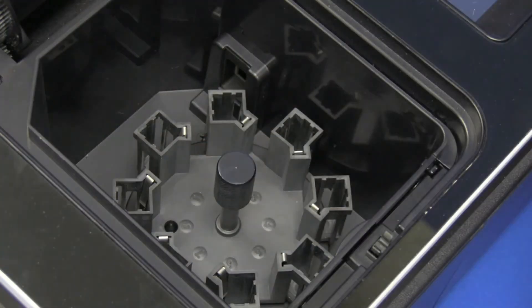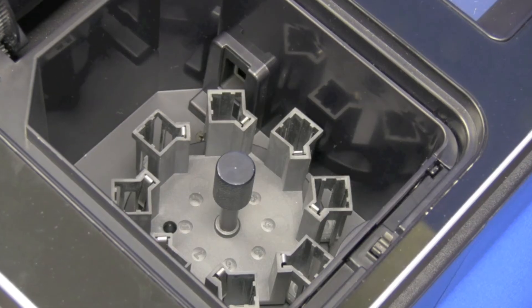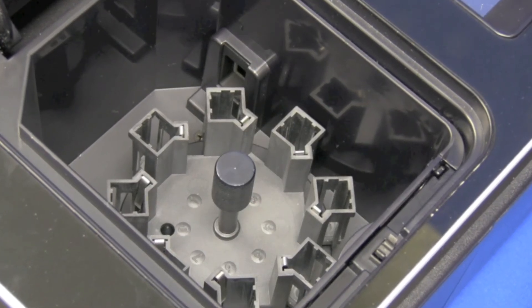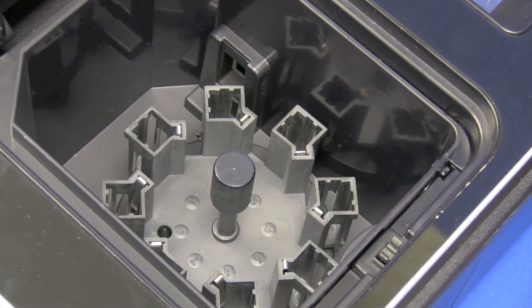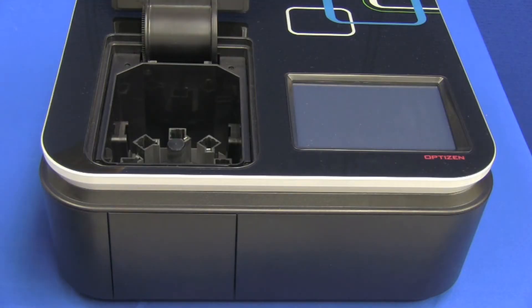This isn't the only cell holder option available — there's a wide variety to choose from. Just a few examples would be the sipper systems, the temperature cell holder systems, the film cell holder systems, and perhaps one of the more interesting ones: the nanoliter cell system. This actually provides similar functionality to what you would expect from instruments like the NanoDrop.